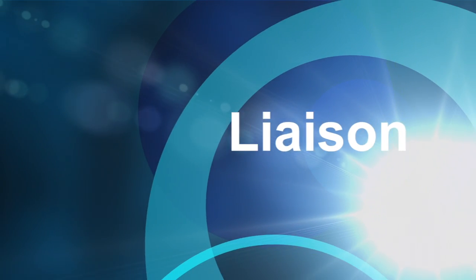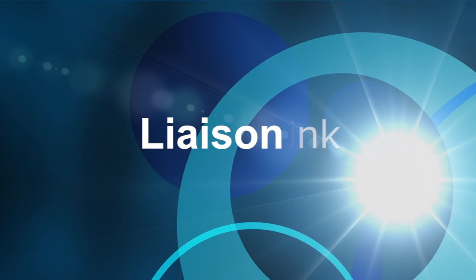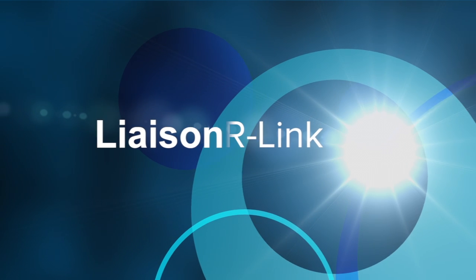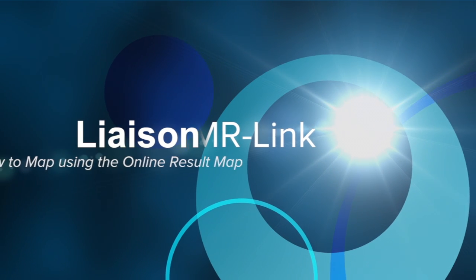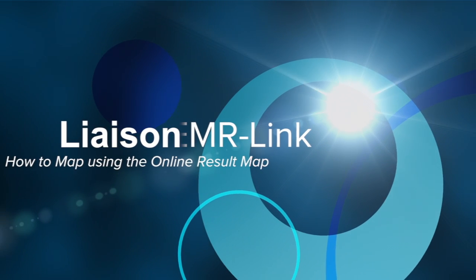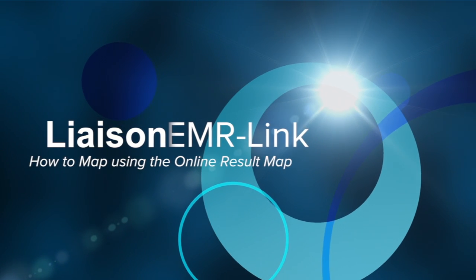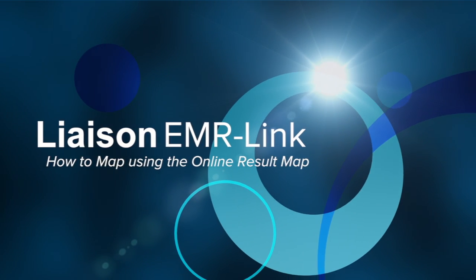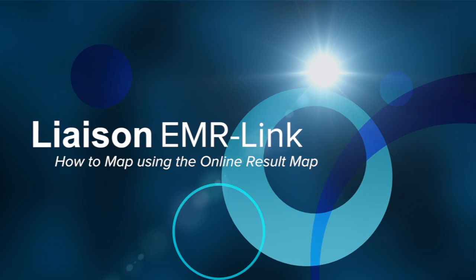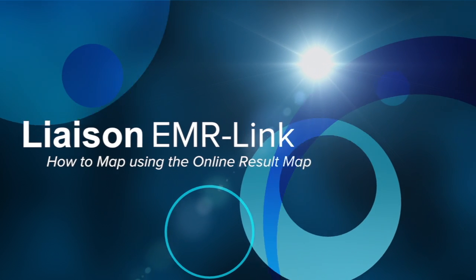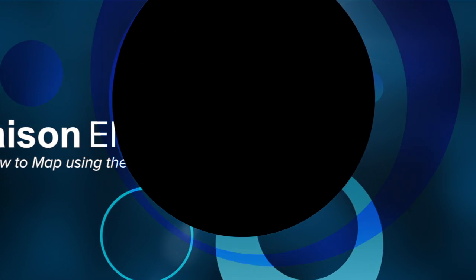Welcome to EMR Link video training. Today we're going to walk through the steps on how to map lab result codes to EMR codes, observation terms for centricity users.